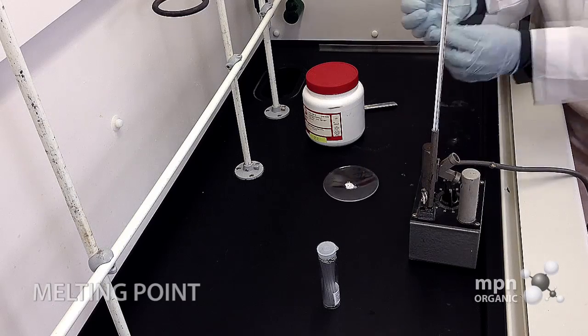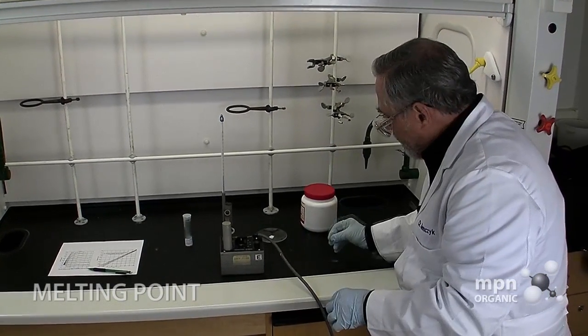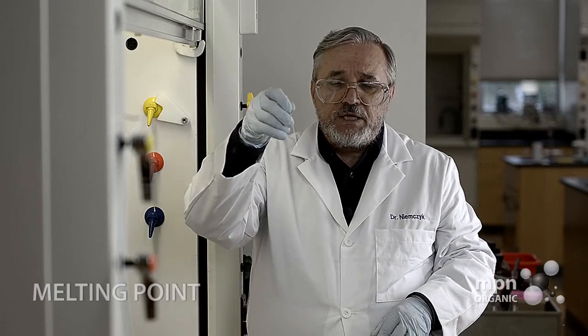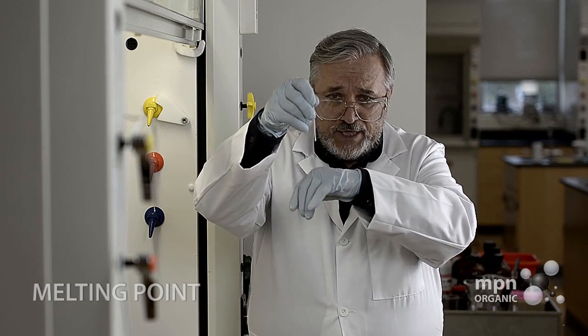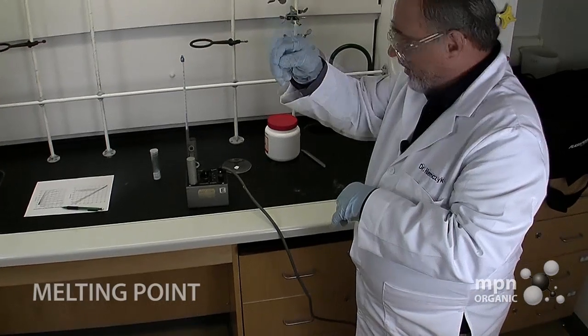Now, how do I get that from here down to where it should be, at the closed end? Well, the easiest way, if your sample is dry, is to just simply tap the closed end onto the desktop, and it should pack it down. It's about 4 millimeters right there. You can't see that, but it is.